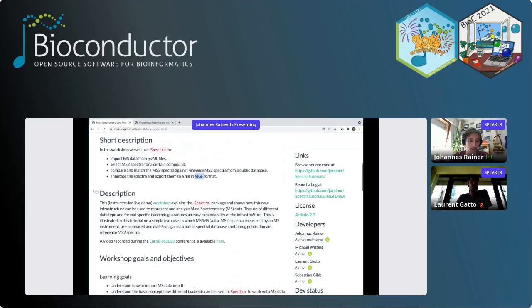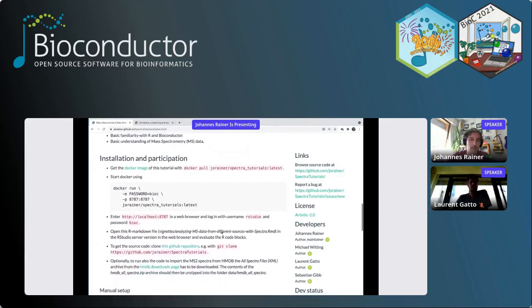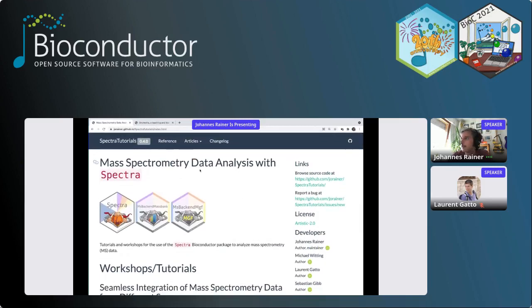Another information also here. I will walk you through this workshop, but there is also the possibility to run this whole workshop on yourself. So there's a Docker image, like usual with these workshops, that you can run locally in your computer or also in this orchestra setup system. And right, with that, okay, I don't see any questions. I jump into the workshop itself.